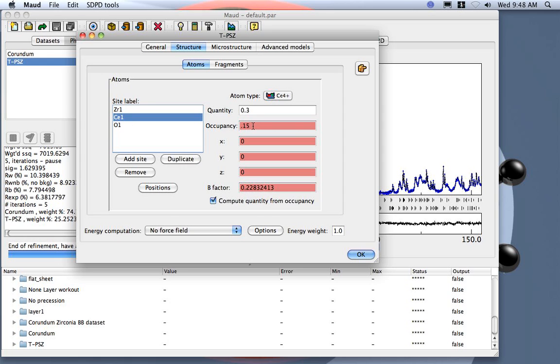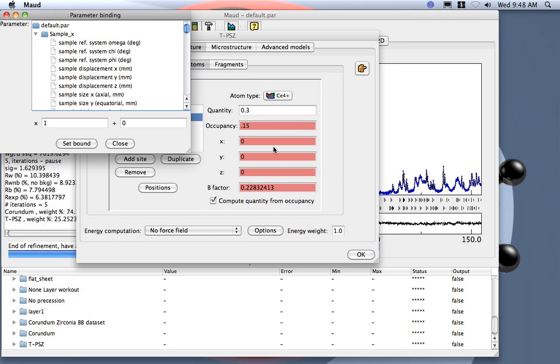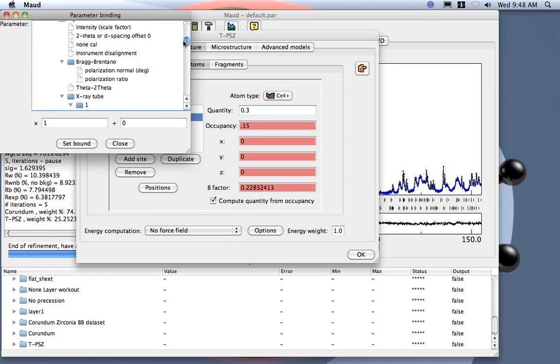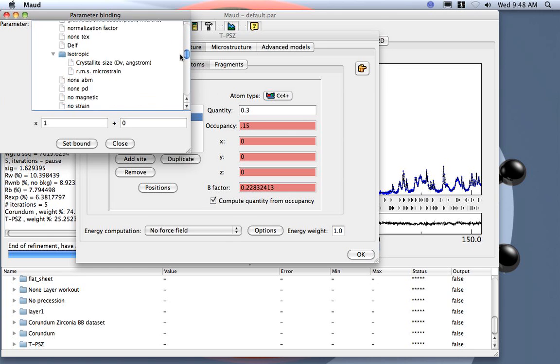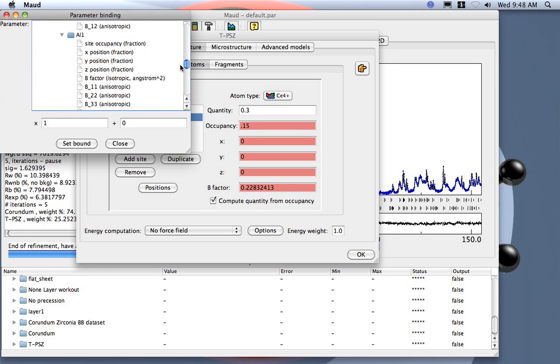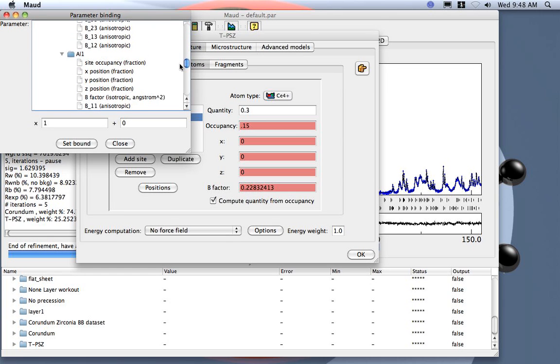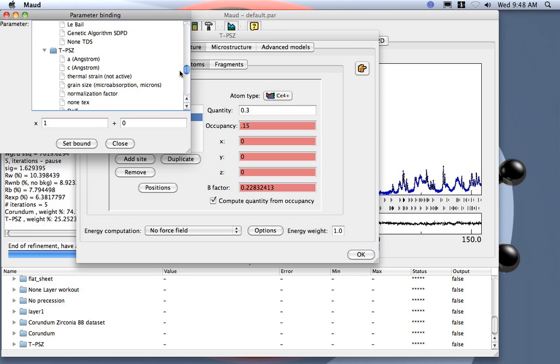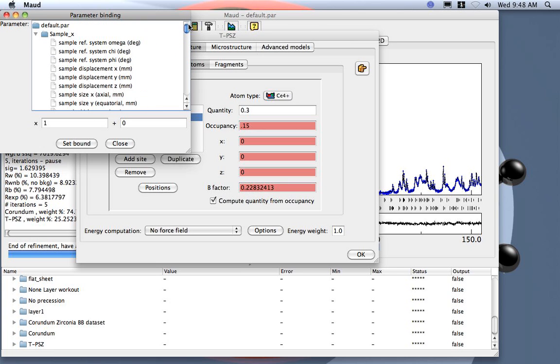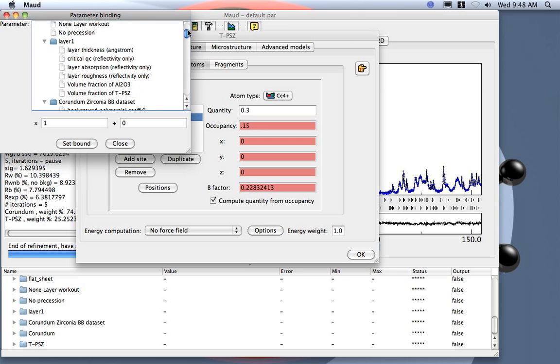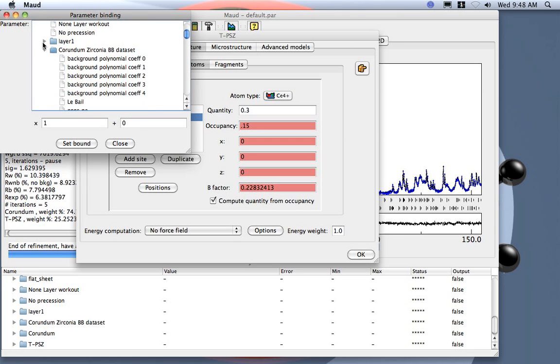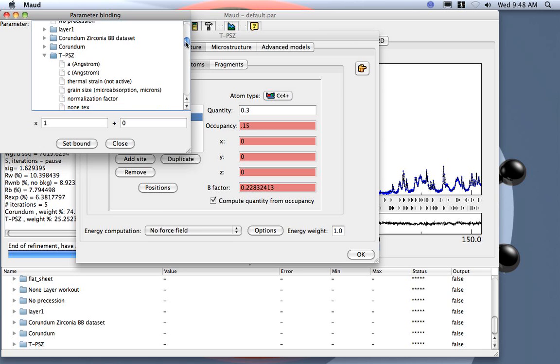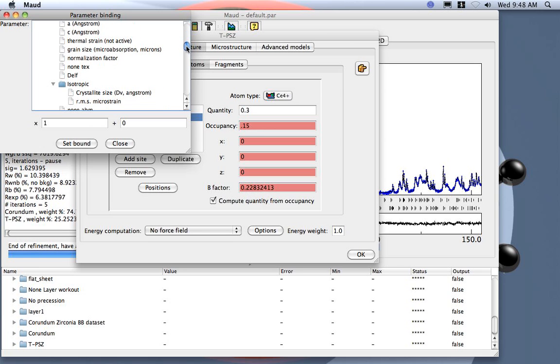We put a bound, actually. What is best is actually to just close this—here is the corundum, we close it—and we go directly to the zirconium.